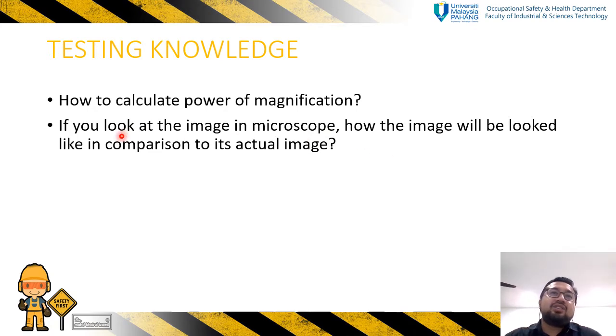Alright, testing knowledge. Okay, so nak test you all faham ke tidak benda saya cakap tadi. Number one, how to calculate power of magnification. Siti Balkis. Macam mana? Macam mana nak kira power of magnification?